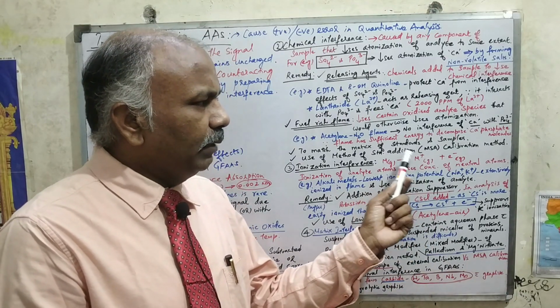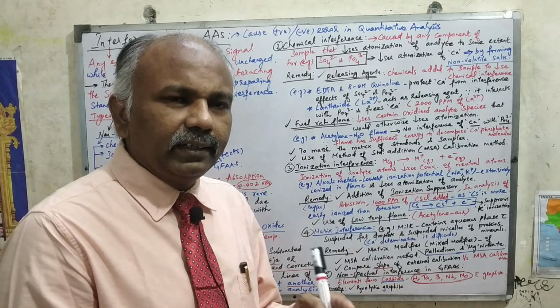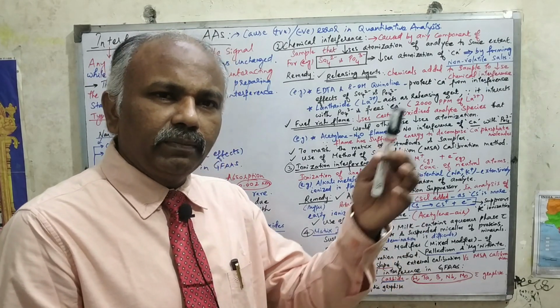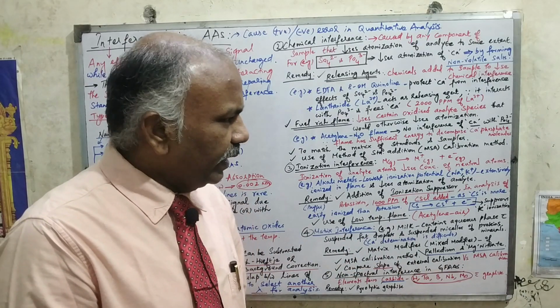So this MSA calibration technique is a very widely useful technique, which is also called the standard addition technique, and this will be used for quantitative analysis. We will discuss this in detail when we discuss the applications of atomic absorption spectrometry, right?